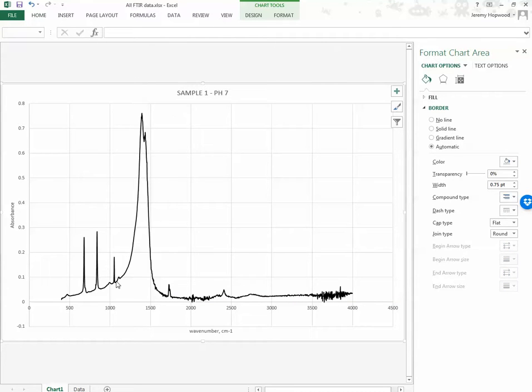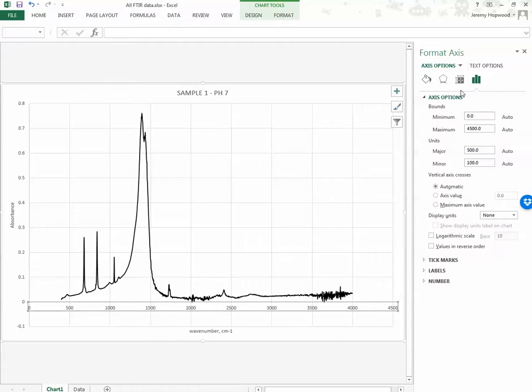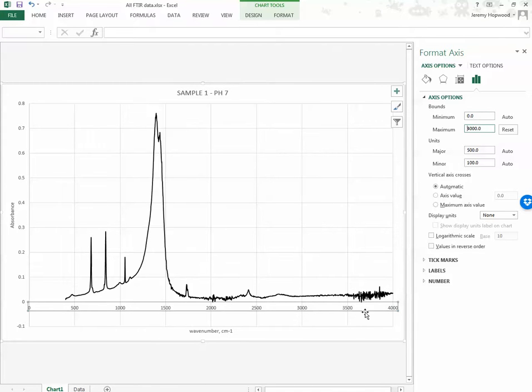So now it's in black, and it's from 0 at the moment. It's 0 to 4,000. It goes a bit up to, there's a bit of redundant space here, up to 4,500. So I think I'll probably make the scale a bit different. So I'm going to click that bit here. Can you see where I've clicked it in this area? You get this little rectangular box. You click in that box, you right click it, you format axis. And then it's got maximum, minimum. Well, the maximum I'm going to say is 4,000. And return, and there you can see it's displayed up to 4,000.